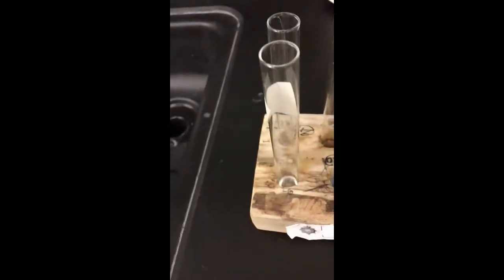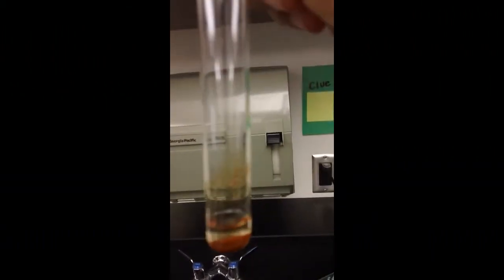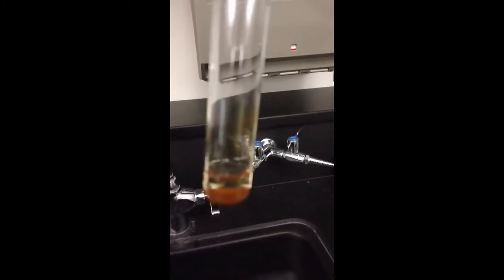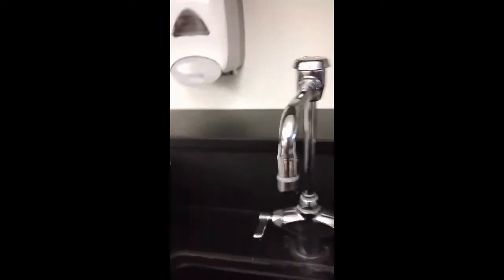Okay, so here we'll go. This is CR, no solid, so I keep it for step 3. Now here I double check. Notice how I do have a solid here. Okay, so this is my FE. I do have a solid, and I know this is kind of hard to do with only one hand and one's holding the videotape, but I'm going to remove the liquid from the solid.